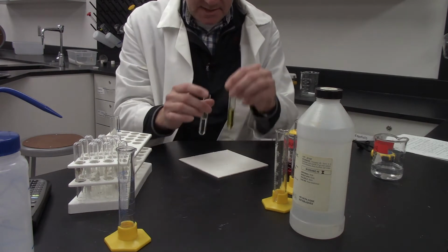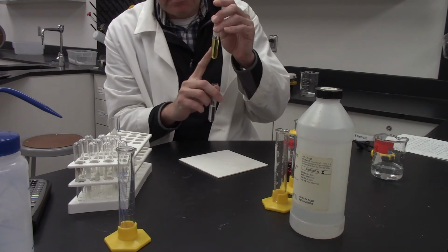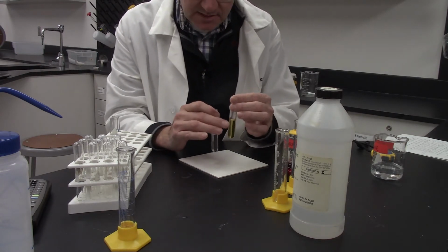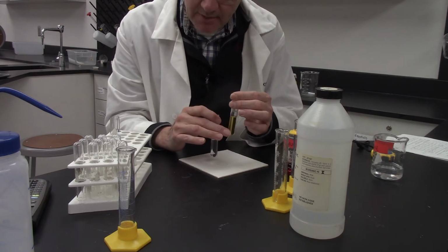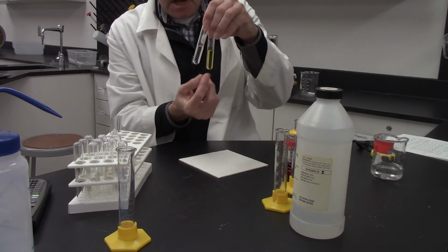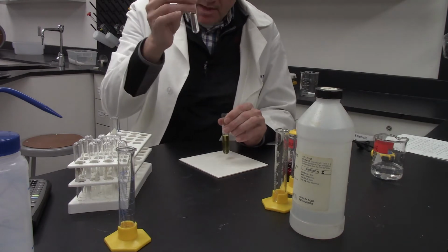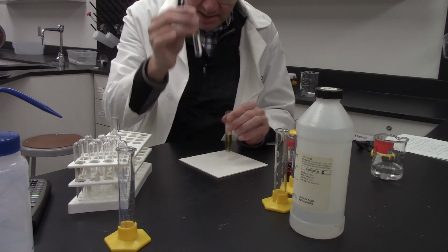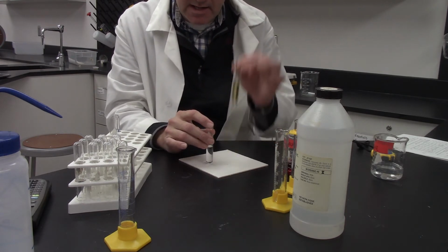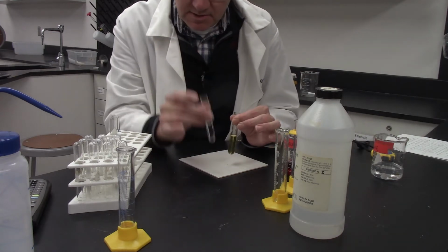So what's going to happen is that we just passed a minute. As this reaction is running, the iodine is going to fade out. As that iodine fades out and gets used up, it's going to turn clear. I've got just a water blank, and I'm going to stop that stopwatch as soon as this reaction goes completely clear so that it looks like water.